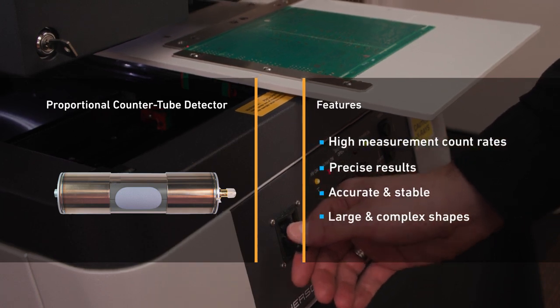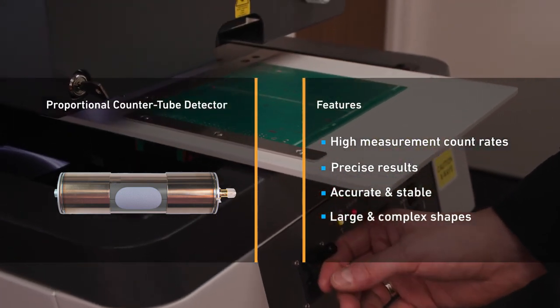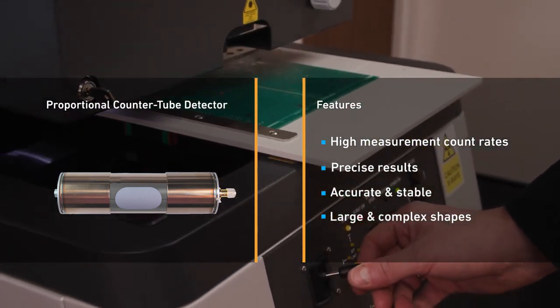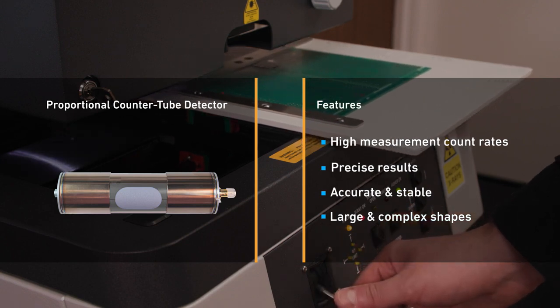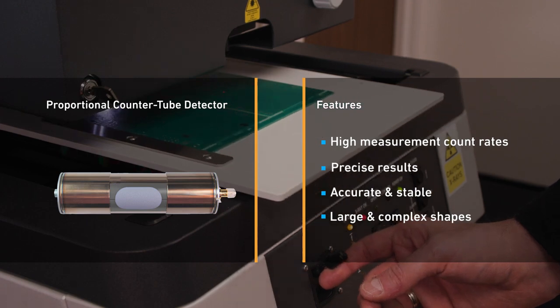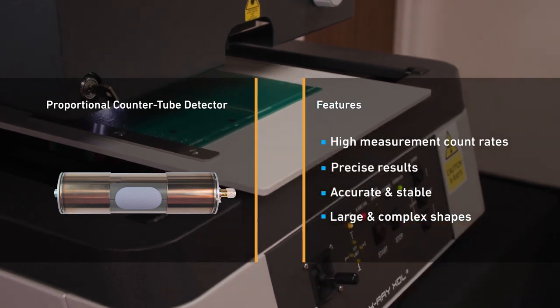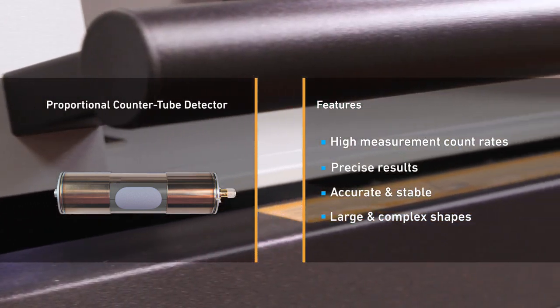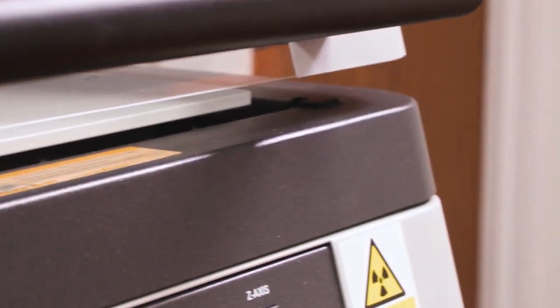The XDL instrument range benefits from a proportional countertube detector, with a large X-ray capture area producing high X-ray spectrum count rates and excellent precision, even at long measuring distances. This type of detector can be distant from the measured surface to accommodate large or complex shapes, which is a significant advantage over silicon-based detectors that must be close to the measured sample to be effective.